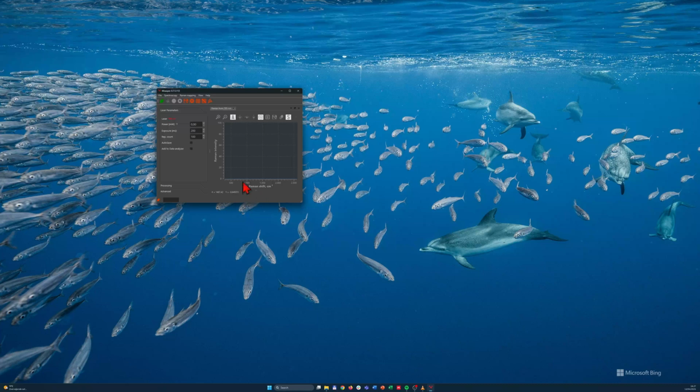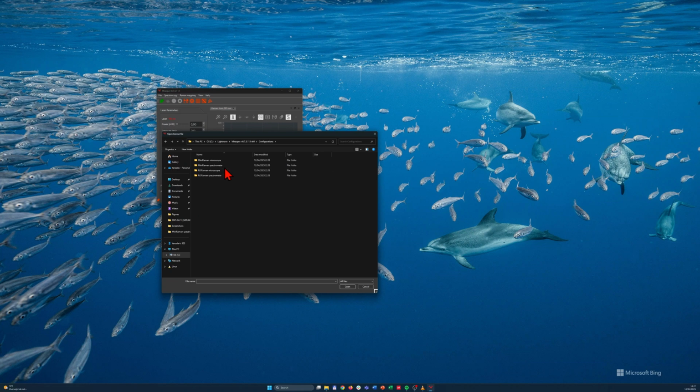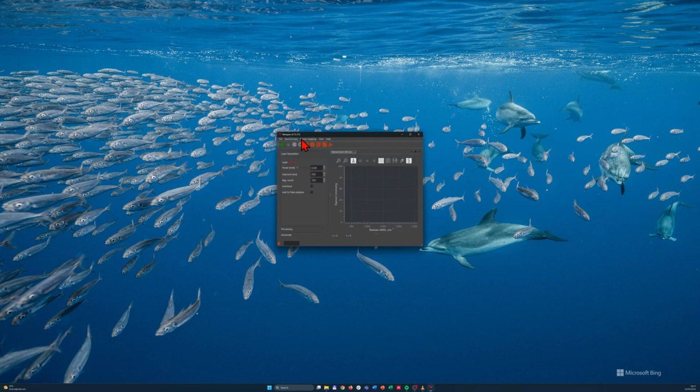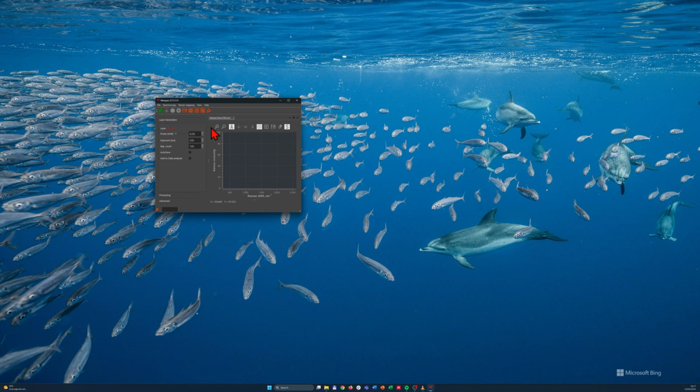In the beginning, we need to make sure that the proper configuration is loaded. Since our instrument is miniRaman 785, we need to go to Help, Set Configuration. We go to the Configurations folder, and we choose the miniRaman Spectrometer subfolder and the Standard 785 nanometer preset. Now we loaded the proper preset.